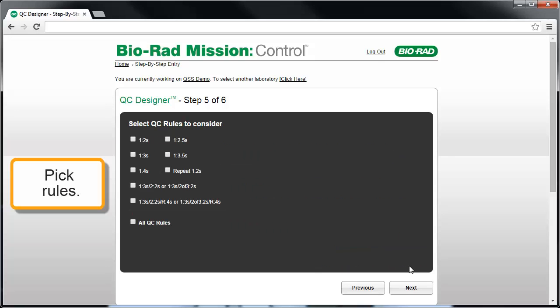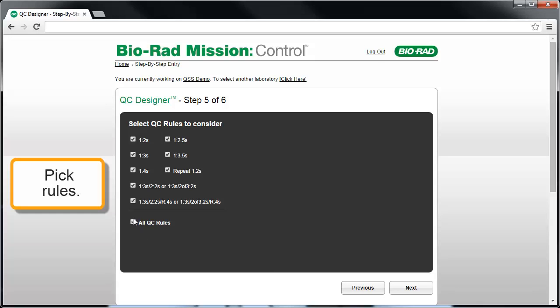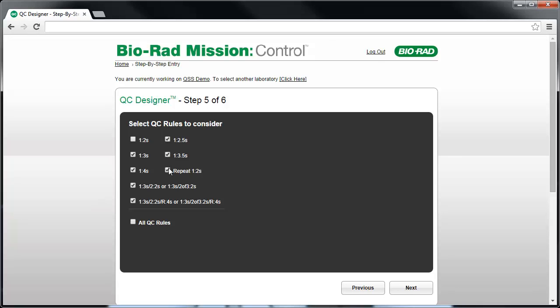In Step 5 of 6, pick the QC rules you wish to consider. In this case, we'll pick all rules except for the 1-2-S and repeat 1-2-S rules. Click Next.